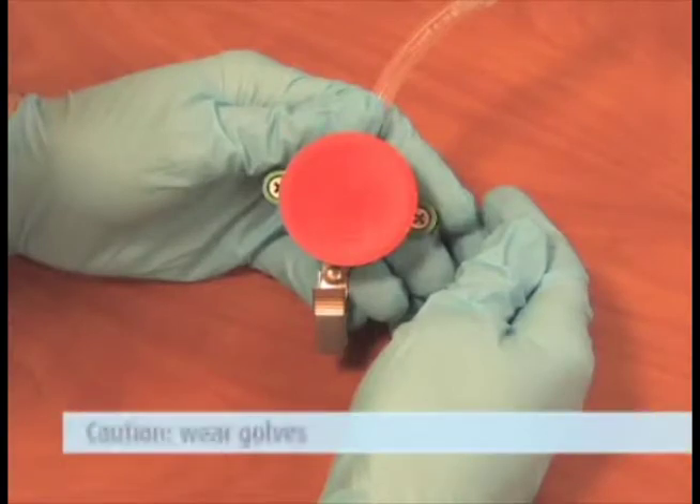CAUTION! Wear gloves when handling filters and samplers to avoid the transfer of moisture and cross-contamination.